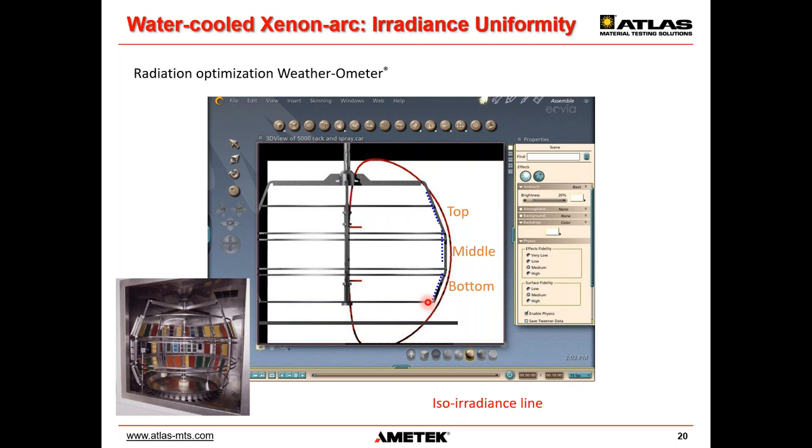That's typically only important when you have these static sun test, flatbed testers, where it's really hard to reach into the corners and into the sides of the test area. That's why it's quite useful to do manual repositioning inside a flatbed, but the rotating rack chambers don't require that.